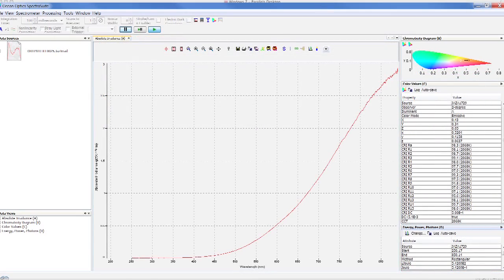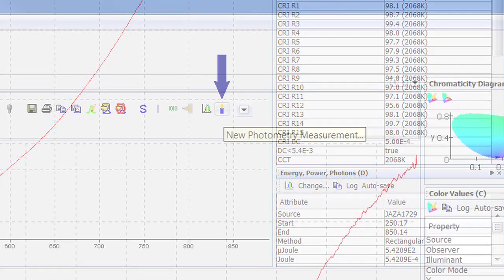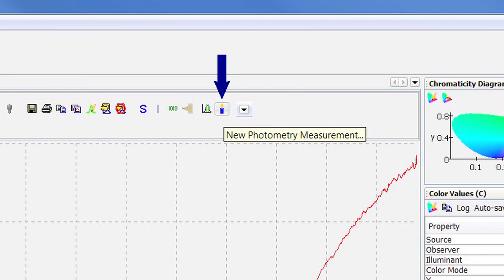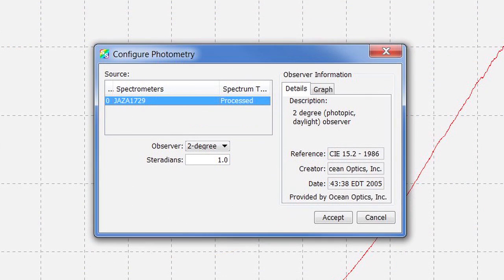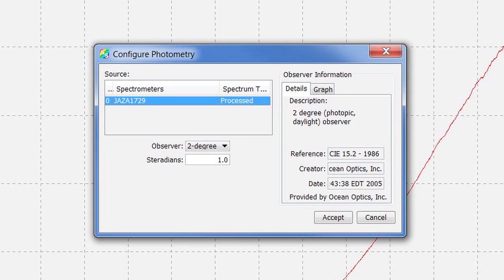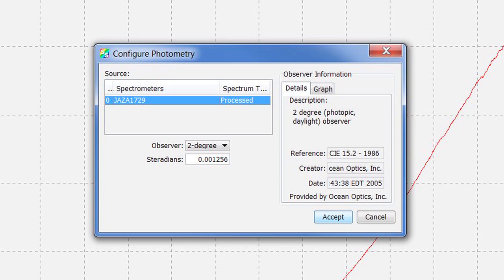Now we will demonstrate how to do a photometric analysis. Click on the candle button on the graph toolbar. A box will open titled Configure Photometry. In this box, you will need to select from 2 or 10 degree observer, and you will need to input the steradians. We'll use the 2 degree observer and input 0.001256 steradians based on the measurements that we previously took.